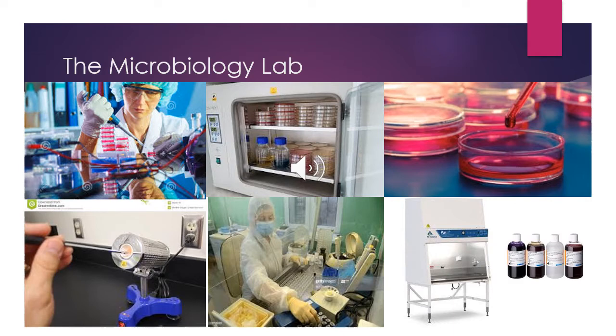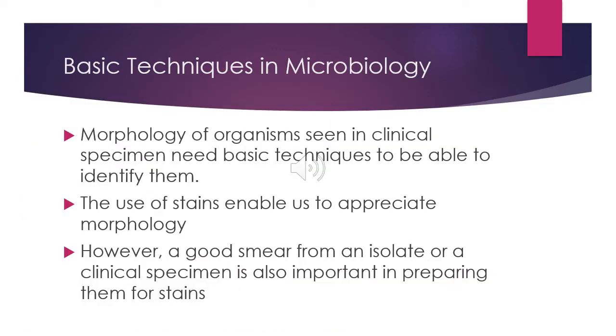So first of all, we would like to introduce some basic techniques that we employ to be able to isolate microorganisms from clinical specimen. Identification of morphology of isolated organism is basic in a successful workup of microbiologic specimens. However, before we start with staining, to be able to appreciate morphology, a good smear is a basic foundation for every microscopist or microbiologist.